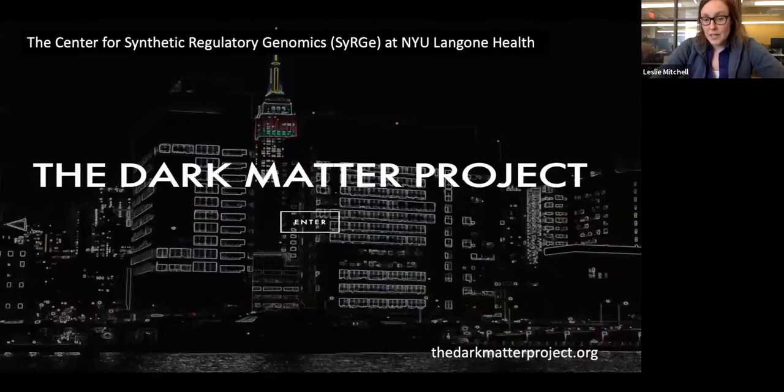A lot of this in Jeff's lab has been formalized in the context of this project called the Dark Matter Project. The purpose of this is to start to understand the function of non-coding variation in the human genome. It's also about thinking about how regulatory elements impact gene expression. And so I also encourage you to check out this project. At this point, there are about 20 different loci across a lot of different organisms that are in play to start thinking about these long DNA delivery projects. A lot of it is going into mouse, and a lot of it is cloning mice to understand some pretty sophisticated phenotypes.